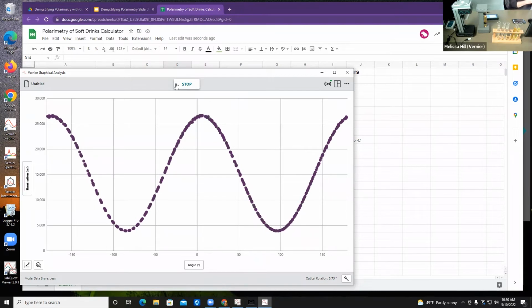And then there's this negative perception of fructose, which is in the Mountain Dew. And it just leads into a lot of conversation you can have about not only food chemistry, but nutritional chemistry, and comparing what is determined with an instrument versus what's on the label.